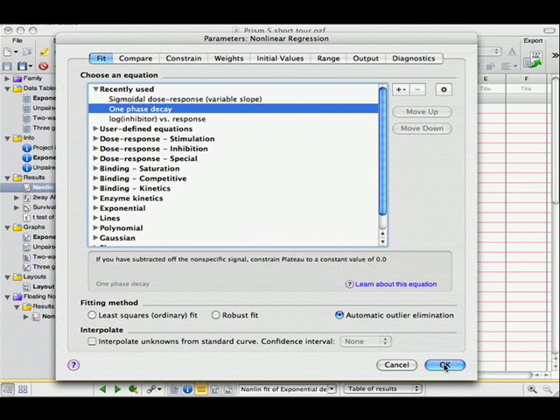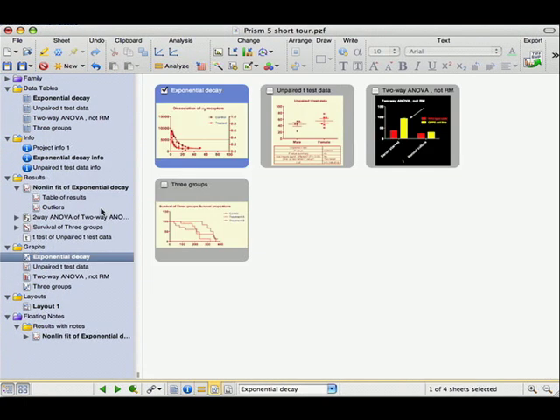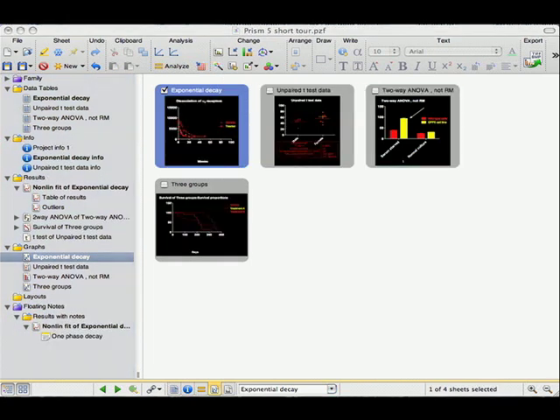Another great new feature is Prism Magic, or Make Graphs Consistent. Select a number of graphs from a gallery or one by one, click the magic wand, and you can make them all the same. Formatting, size, axis limits, etc. It's a great tool.